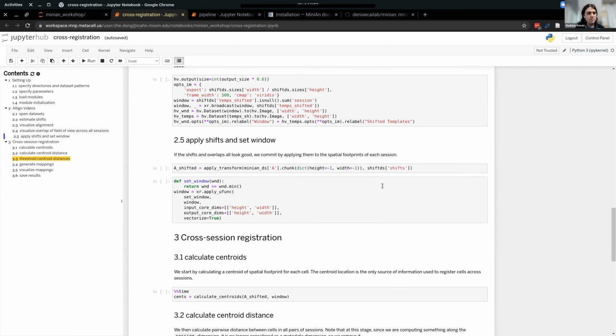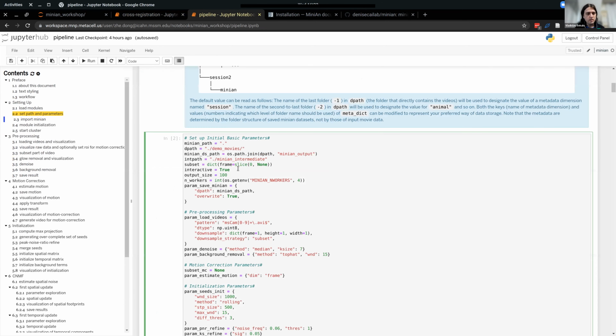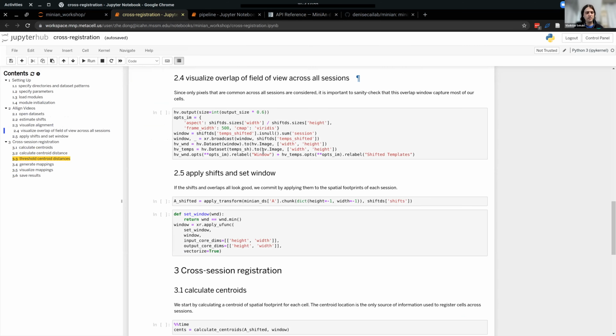Just quickly, that metadata dictionary that you mentioned. Basically, it's just pulling the folder name out. Yes, it's like which level of folder to use as the metadata. Okay, great. If you hit that, you just make sure you assign the coordinate, like you make sure you fix the session before usually running, and put it in that kind of folder structure. Okay. Well, that's great. Thank you.